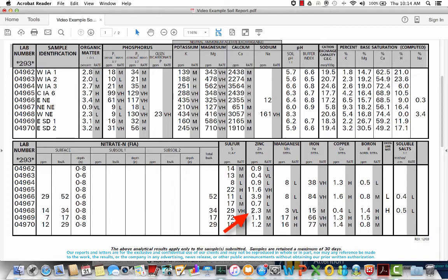Alright, so we get into this western Nebraska soil. Again, we're above 2 part per million zinc, so probably not a recommendation here from our side. If you want to put a little zinc in a starter, especially if you're doing some early planting dates and you want that zinc, corn and zinc kind of seem to go together. If you want that zinc in a starter fertilizer, you might still make a recommendation for the starter, but no reason to build soil test values from our standpoint anyway. And again, we might make a little adjustment based on a very high yield goal, but for an average yield goal, this 2 part per million we think would be fine.